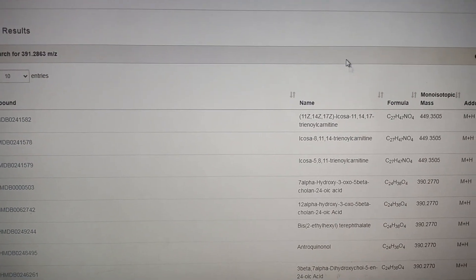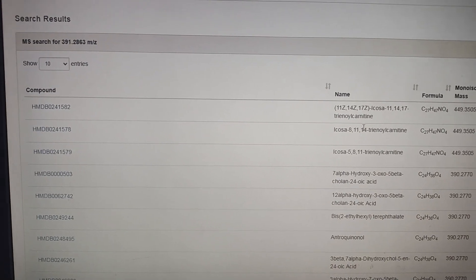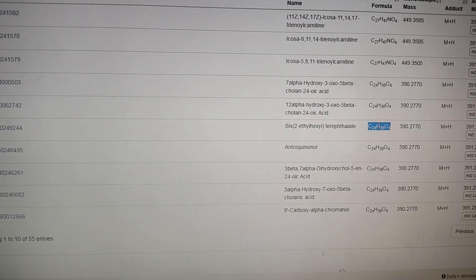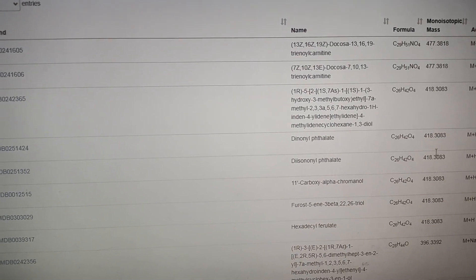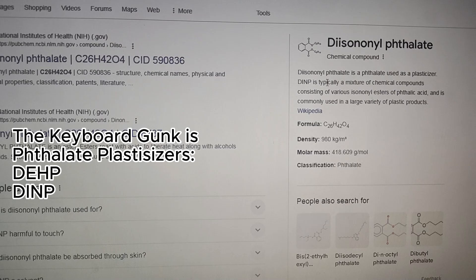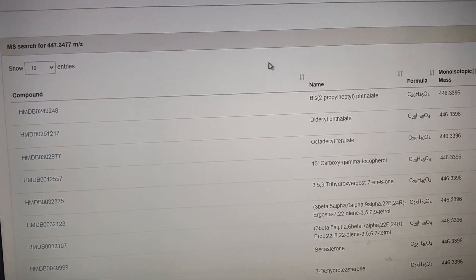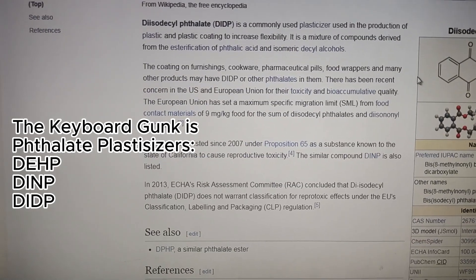HMDB results — I think I'm finally seeing it. I was getting confused by biomolecules that didn't fragment; I kept thinking it was something from my fingers. But when you search this formula — and I'm pretty confident in that formula being right — it actually hits bis(2-ethylhexyl) phthalate, BEHP. That's a plasticizer. Going down to the 419 mass, we're hitting another plasticizer, DINP. And the next one — sure enough — also a plasticizer.